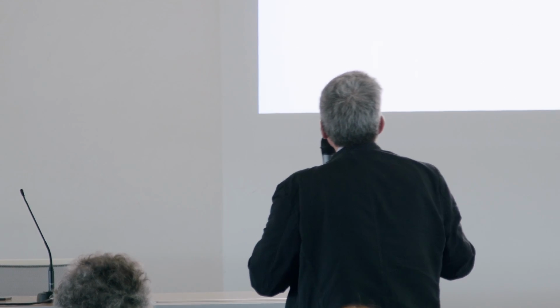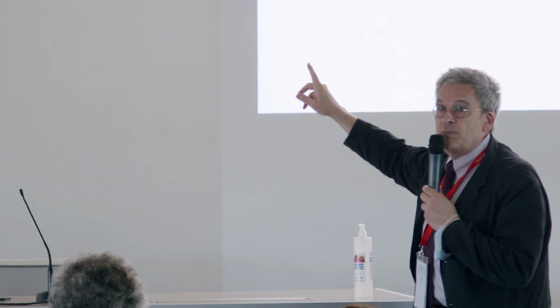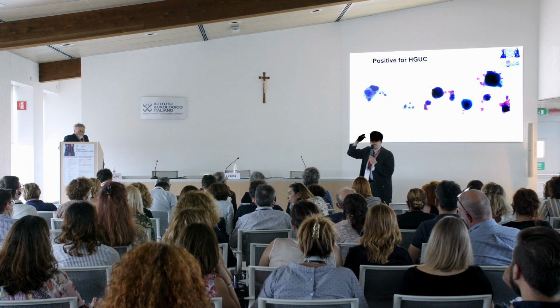So it could be what we call ink nuclei in urine cytology. On the left, it's not possible to make a definitive diagnosis because you always have these degenerated cells in mind.